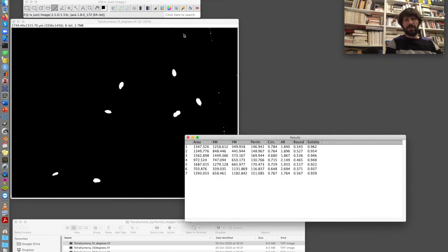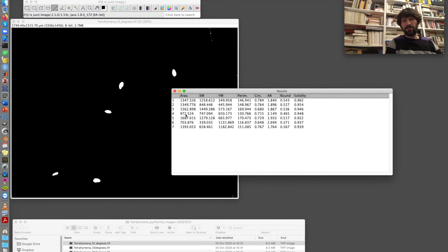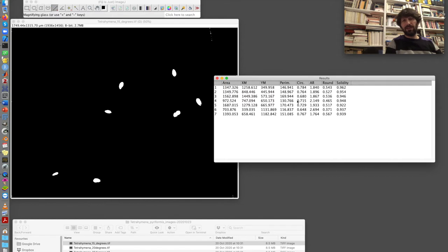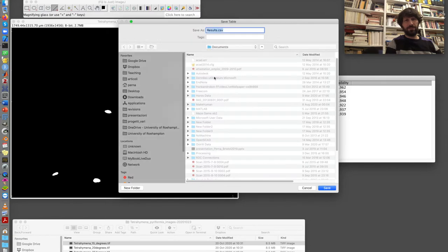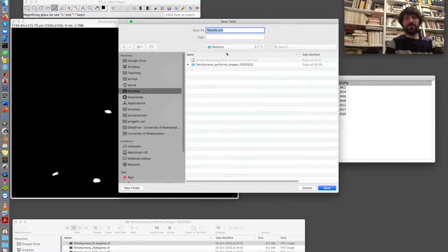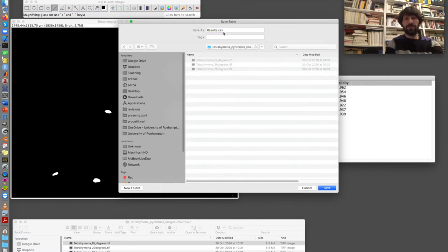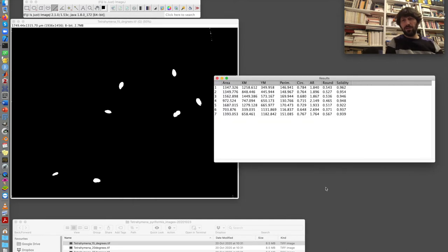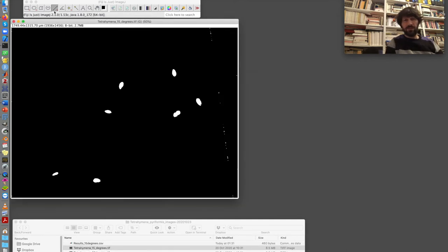So I can go ahead. This is my first result. It is seven objects, which looks good. I just go to file, save as, and save this table here. So it is on my desktop. Tetrahymena piriformis. And this is results for 15 degrees adaptation. And we are ready with the first image.